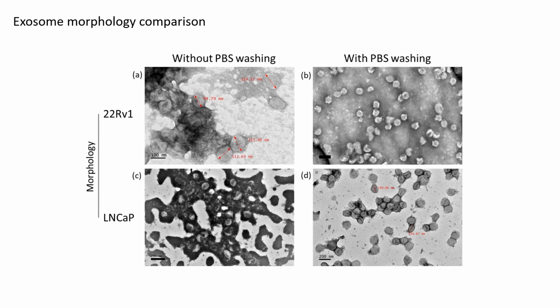Because of the polymer which constitutes the ExoQuick reagent, exosomes were thought to be stacking next to and on top of each other, as can be seen in the before-washing picture. This chemically inert polymer appears in TEM as a negatively stained, homogeneous sort of net, holding the exosomes together. In comparison, after the wash, exosomes are seen more dispersed, scattered, and liberated, with no image of the net anymore.